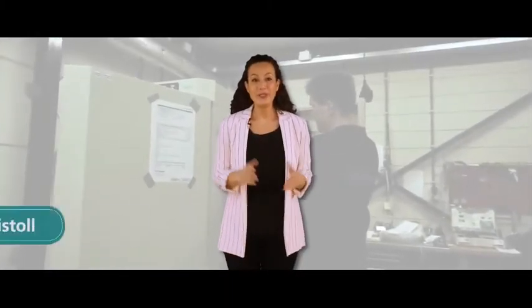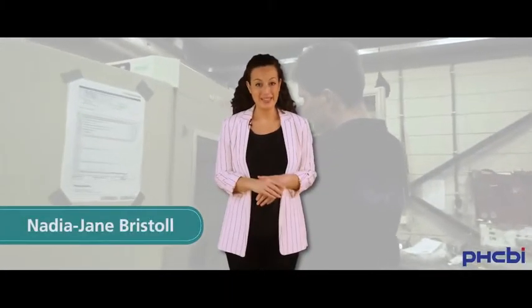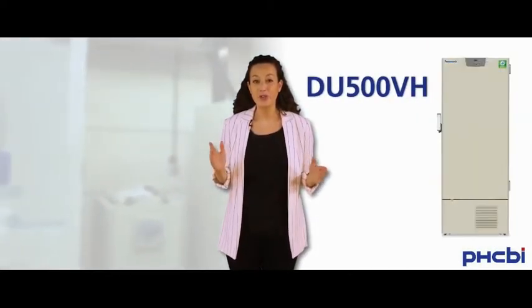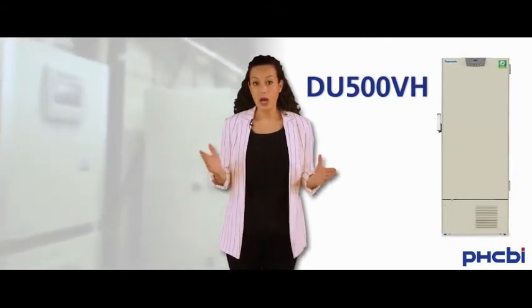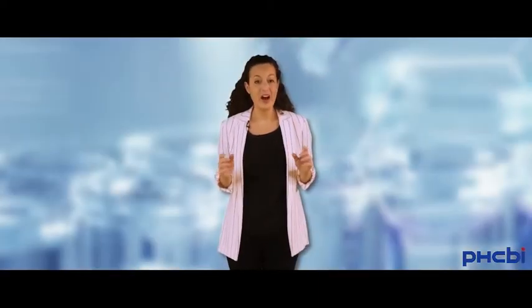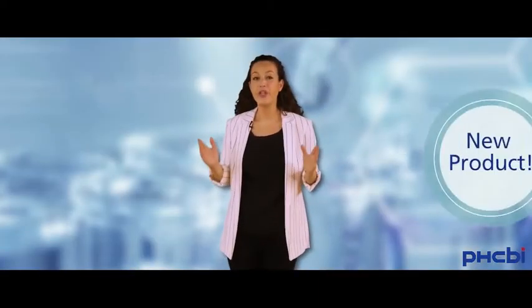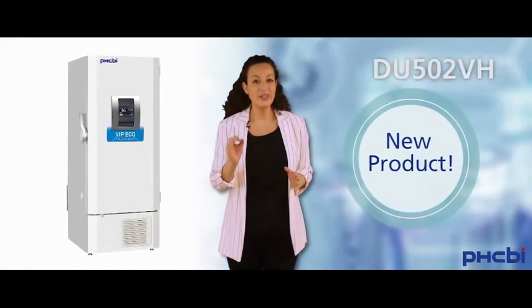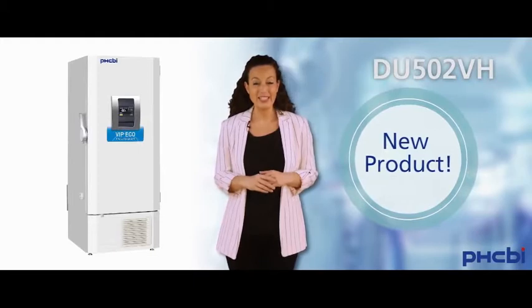Hi and welcome to another short video update. You probably know our ultra-low temperature freezer, DU500VH. It's a highly reliable machine that's been part of our range for many years. But today, I'd like to present to you the new, completely restyled version, the DU502VH.